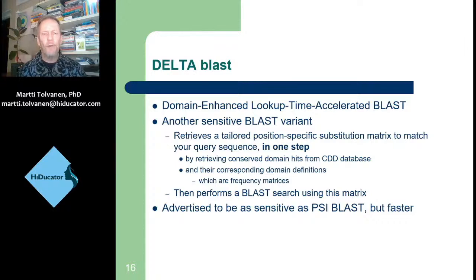So in a way, it's like a one-step PSI-BLAST, but it's dependent on having an appropriate domain definition in the CDD database.